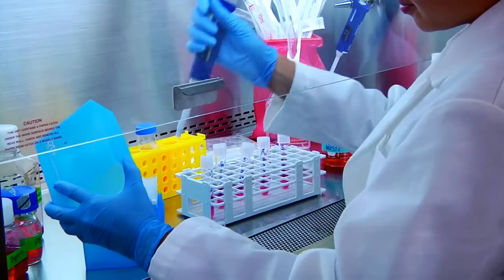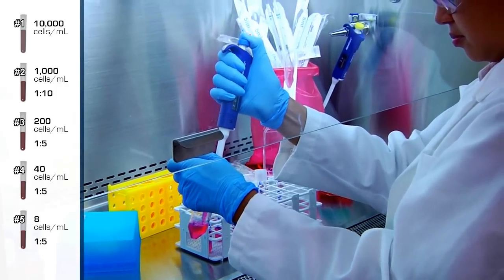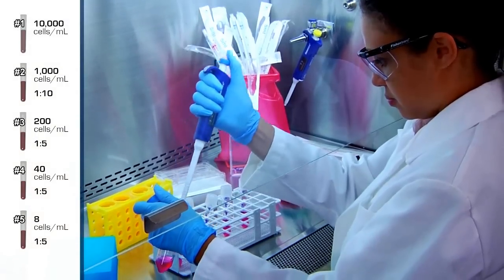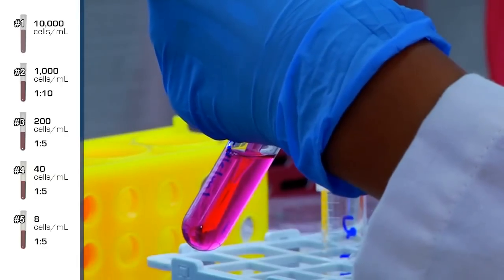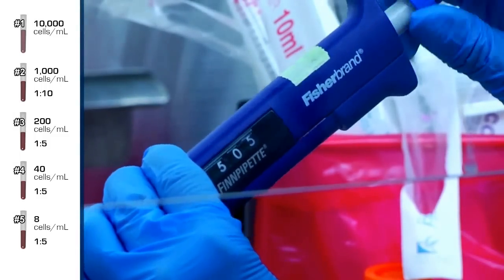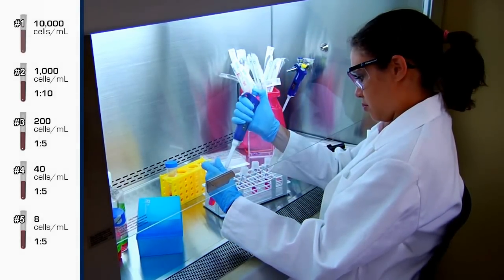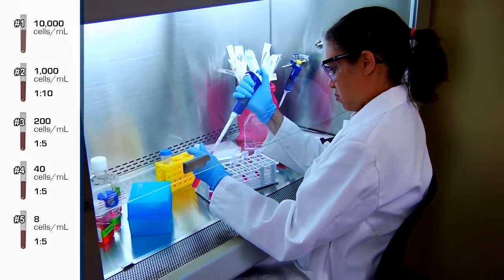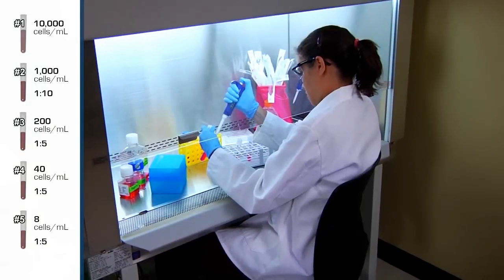Using the previous calculation again, transfer enough cells to tube number 1 so that the final concentration is 10,000 cells per milliliter. As you perform each dilution, be sure to mix the cells repeatedly by pipetting up and down several times. This will help to keep the diluted cells uniformly suspended in the medium. Tube number 1 contains 10,000 cells per milliliter. Remove 0.5 milliliters from tube number 1 and transfer it to tube number 2 for a 1 to 10 dilution. The concentration of tube number 2 is now 1,000 cells per milliliter.